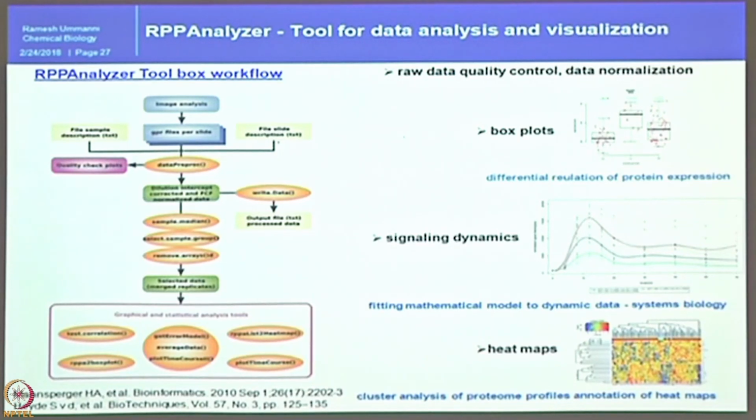The processed data will be here, and then the software automatically looks for quality controls, meaning whether a blank signal is really a blank signal, the signal is really a signal, what is the difference between the blank signal and the real signal, and it will also calculate the signal to noise ratio, and if necessary to drop some of the arrays, it will suggest what to drop, what to include, then we can proceed further.